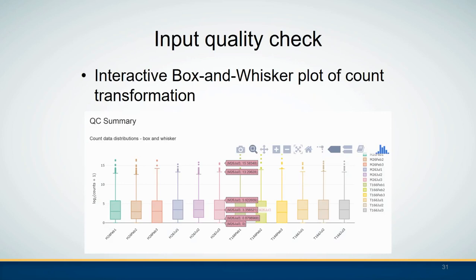IRIS also provides several options for users to check data quality. This interactive box-and-whisker plot of count transformation shows the distribution of the read counts per sample, and by pointing the cursor to different positions of this plot you can see the summary information of the distribution of read counts per sample.